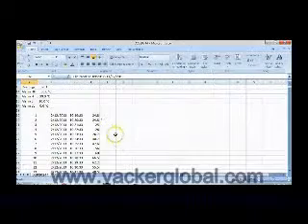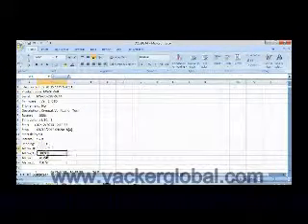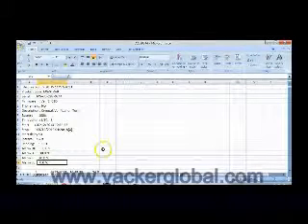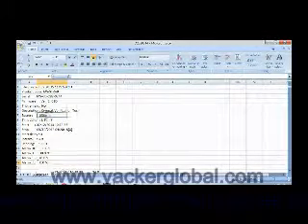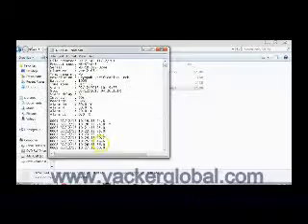Now we will see the Excel sheet. The PDF report was a summary, whereas the Excel sheet gives the complete set of readings for the entire duration. The report also comes in plain text form, which can be seen here.